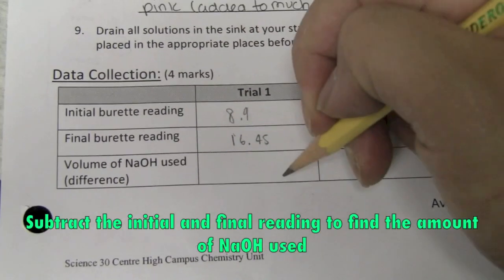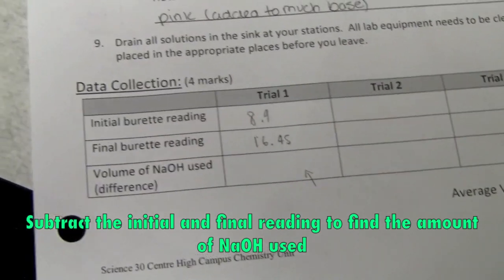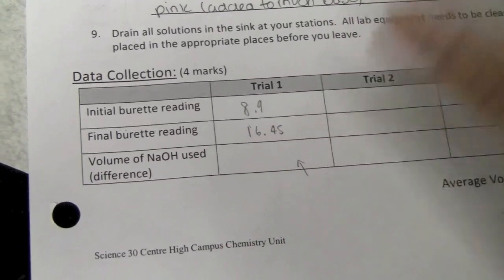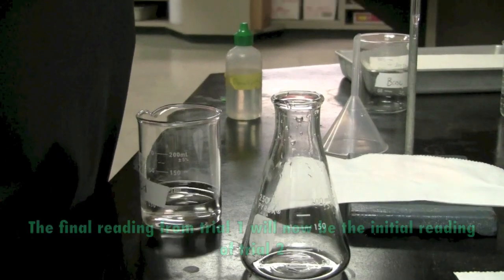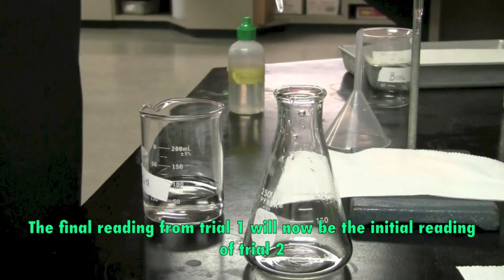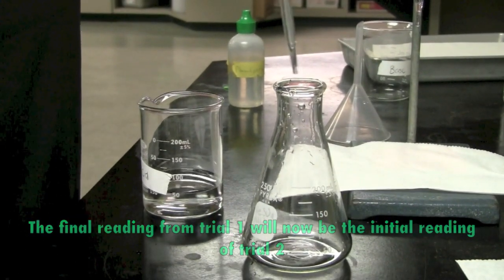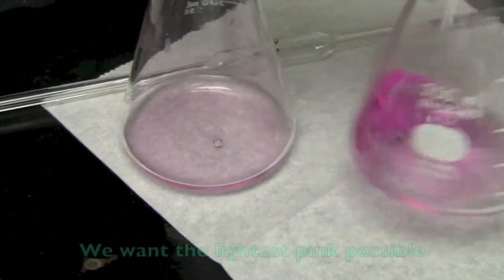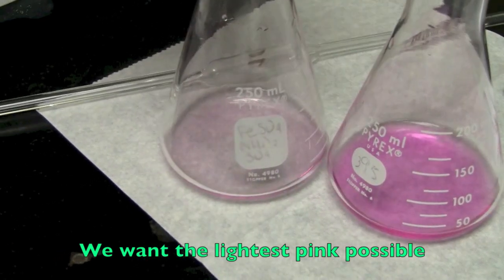And we're going to calculate the volume of NaOH used by subtracting the two. We can just use 16.45 as our initial burette recording for trial two. So compared to the other one, we can definitely see the difference between the two.